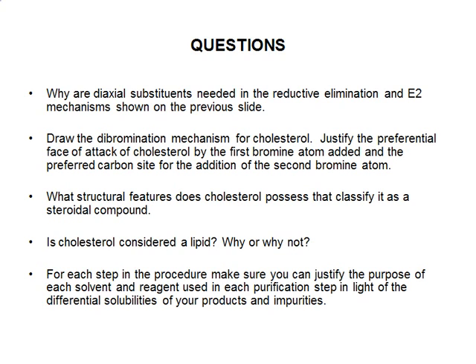Also, what structural features does cholesterol possess that classify it as a steroid? What are the fundamental things that a compound has to have in order for it to be put into the steroid family structurally? Is cholesterol a lipid? What's the definition of a lipid? And of course, for each step in your procedure, make sure you can justify the purpose of each solvent and reagent that's used in each purification step in light of the differential solubilities, particularly of your products and impurities.